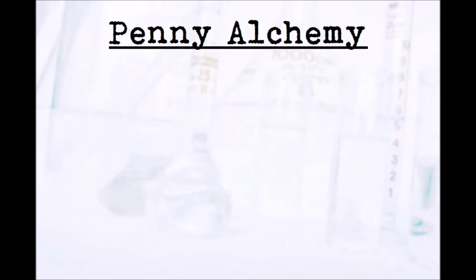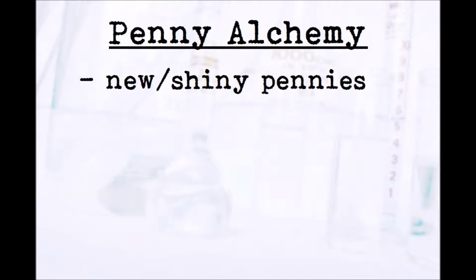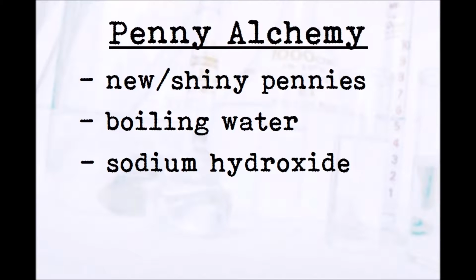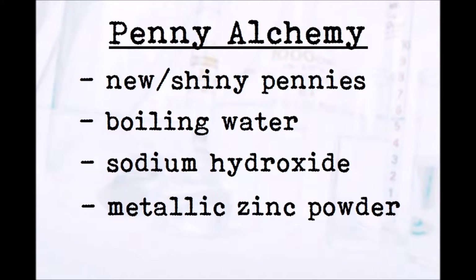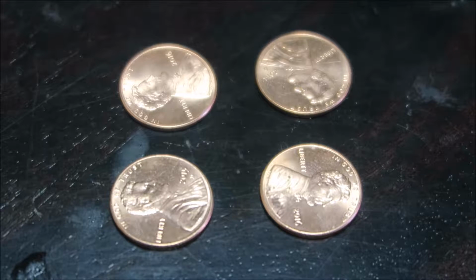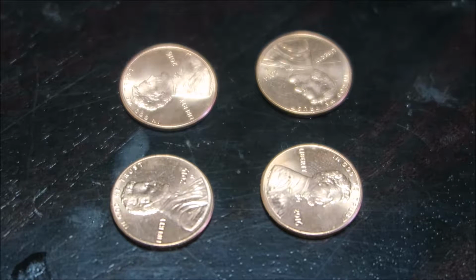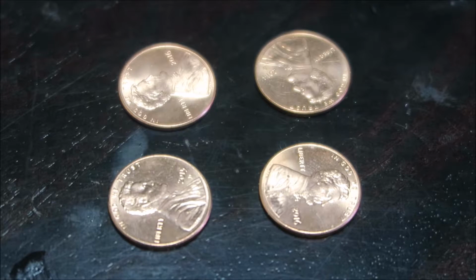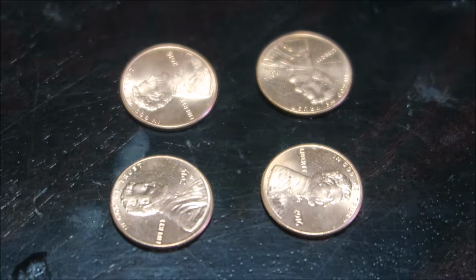Okay, here's what you'll need. Some new shiny pennies, boiling water, sodium hydroxide, commonly called lye or caustic soda, and metallic zinc powder. Yeah, I know these last two probably aren't just lying around your house, but have a little faith. I'll give you more info about them as we go along. It's important that the pennies be new, or at least be clean and shiny, because we need to make sure that the copper on the surface isn't oxidized, contaminated, corroded, or just so covered in dirt that the process won't work.